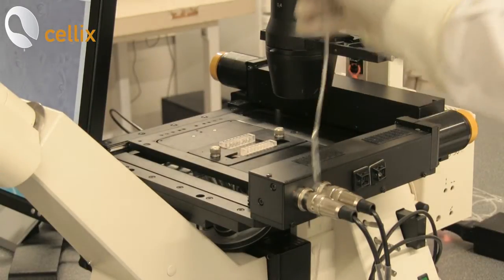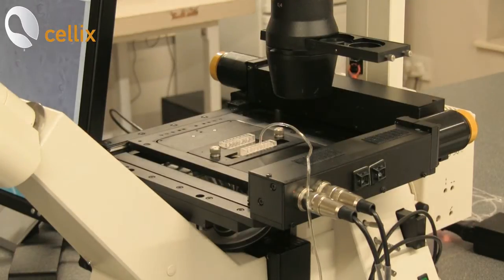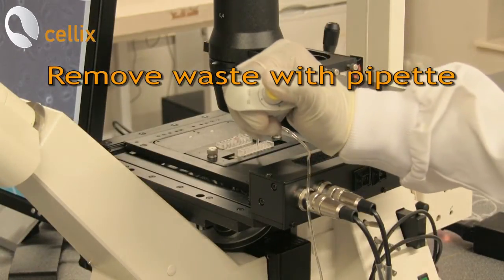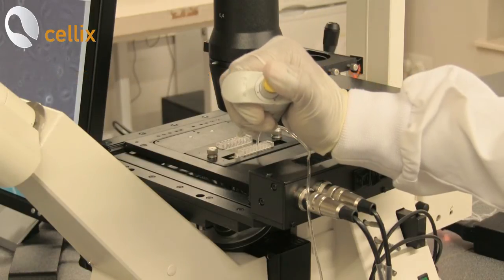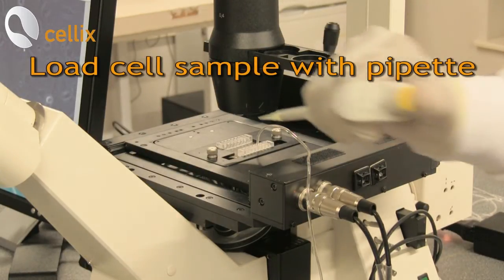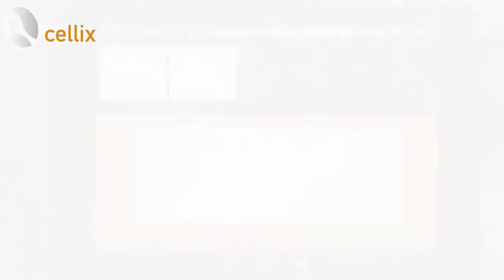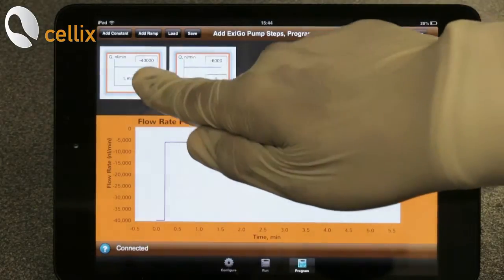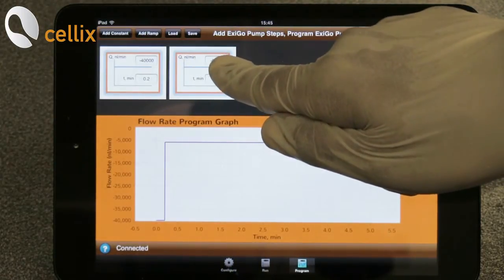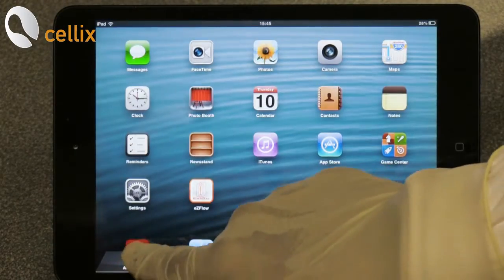The droplet forms. Gently connect it to the channel of the biochip. The washing is started. Next we take out the waste from the other side of the channel and load the sample on the other side. As previously done, here we're going to run at minus 40,000 nanoliter per minute for 0.2 minutes, then minus 66,000 nanoliter per minute for five minutes. You can see these figures from the table.